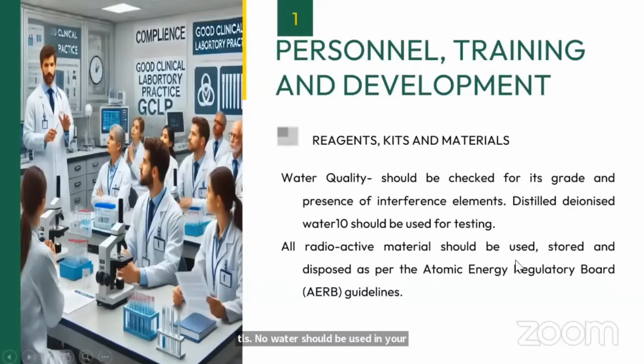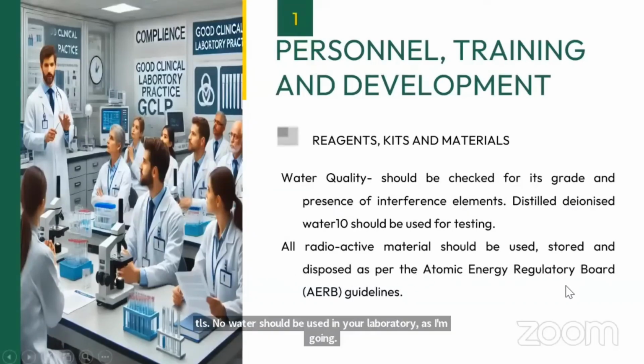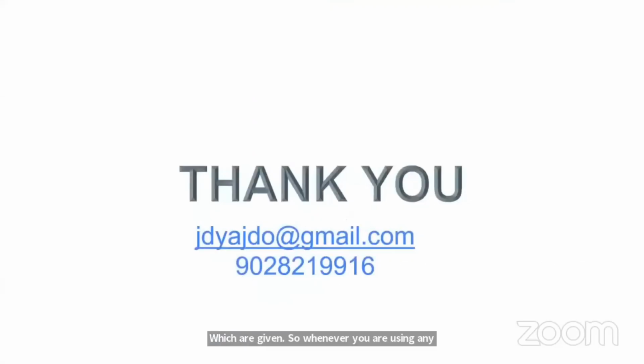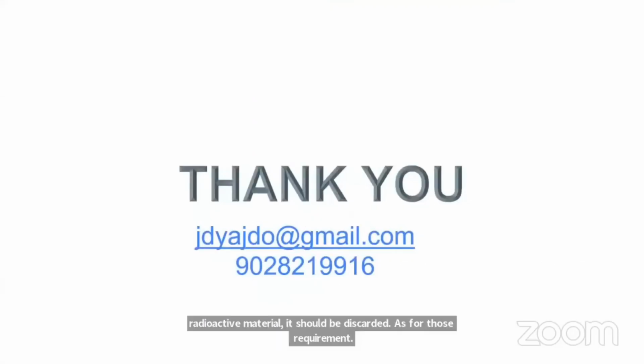All radioactive materials should be used, stored and disposed of as per the Atomic Energy Regulatory Board, that is AERB, guidelines. Whenever you are using any radioactive materials, they should be discarded as per those requirements. So with this, we are concluding today's session.